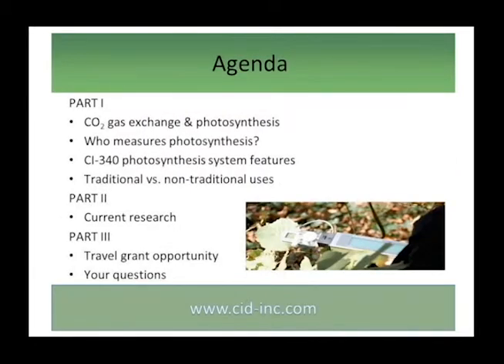So today we'll split the webinar into three parts. In the first part, we'll talk about CO2 gas exchange and photosynthesis, touch base on who is interested in photosynthesis measurements, discuss some of the features of the CI340 photosynthesis system, and then talk about traditional versus non-traditional uses.